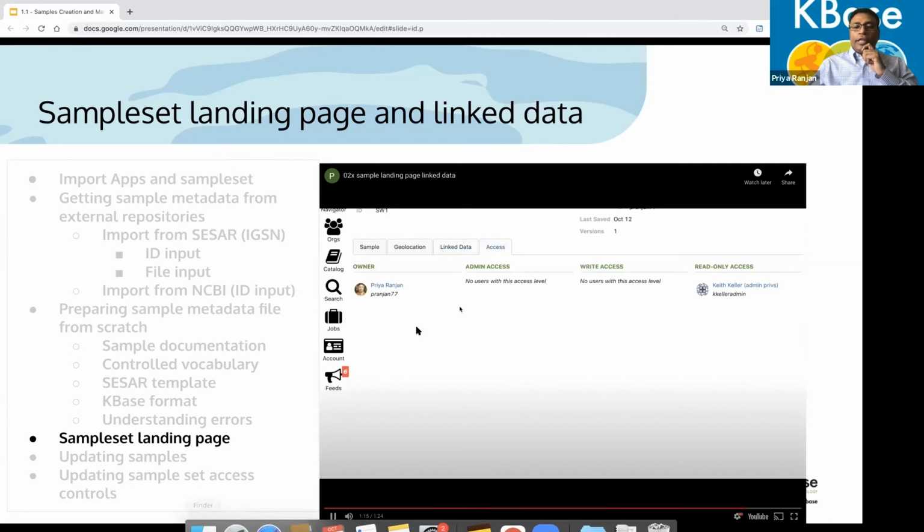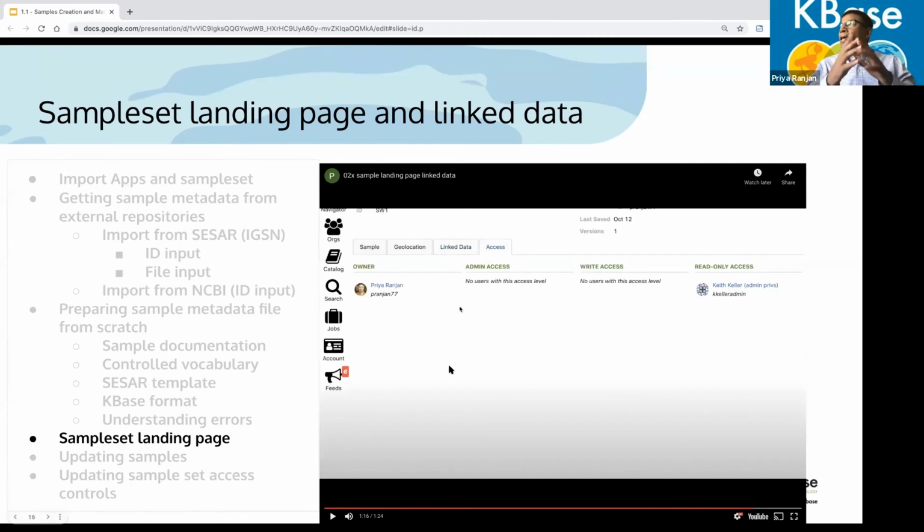And we are also working on, before I move on, easier ways for you to ask questions like, give me all samples that have chemical abundance as well as amplicon matrix so that I can do the correlation. And if other people are uploading the data, you can easily figure that out. So we are working on such apps that will help you find those data sets pretty easily.